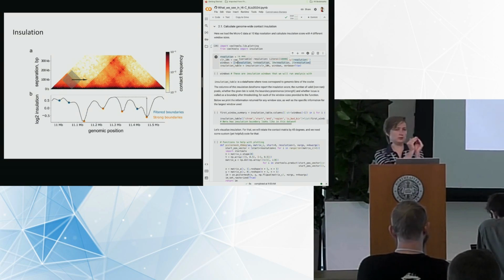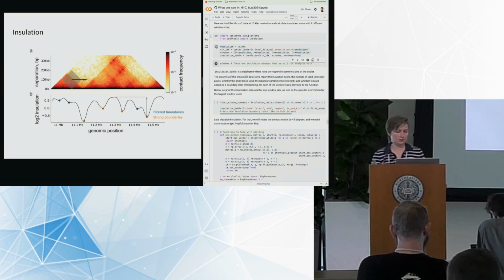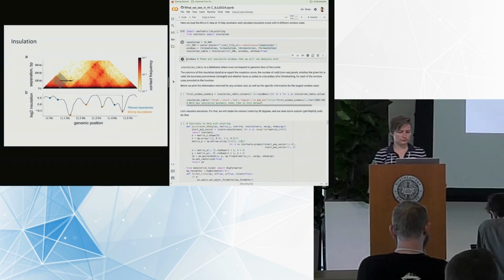We have the elementary bin size, and now let's try to take 3 bin sizes, 5 bin sizes, 10 bin sizes, and let's figure out which one is working the best. This step might take some time because we run the computations for all chromosomes at pretty high resolution.